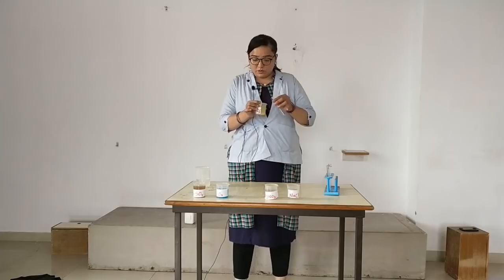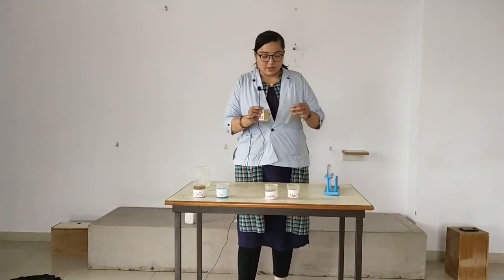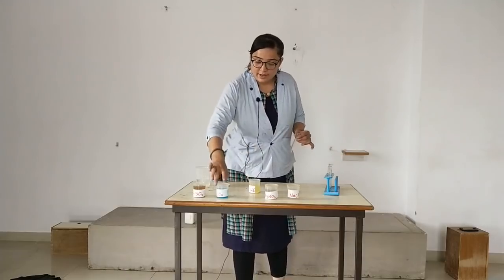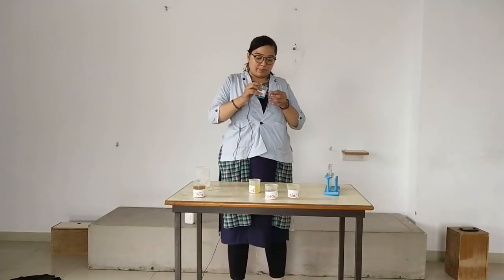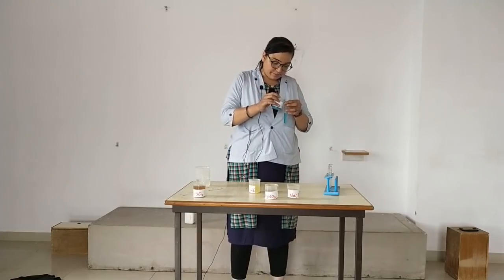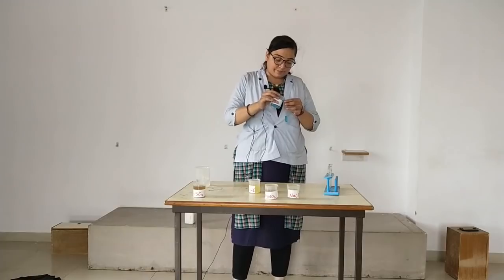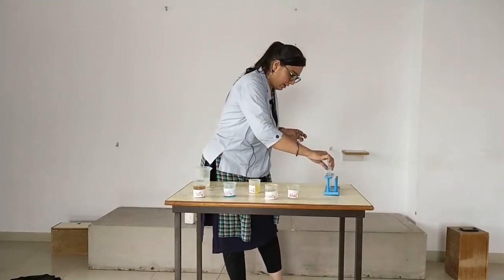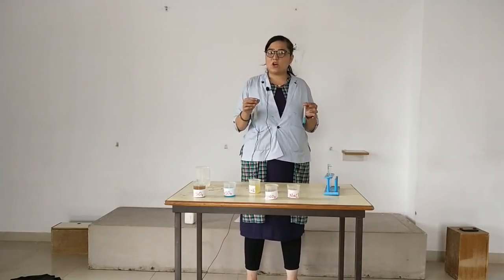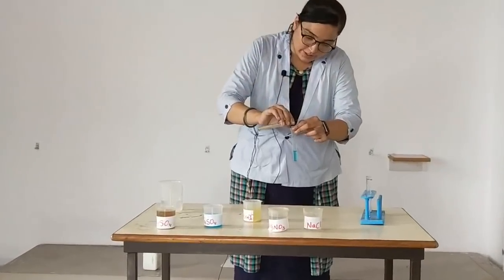You might have heard, no? Shake well before use, somewhat like that. So, yellow colored K4FeCN6. Next, blue colored CuSO4. To this CuSO4, I am going to add this K4FeCN6. Let's observe what is happening. Slowly.